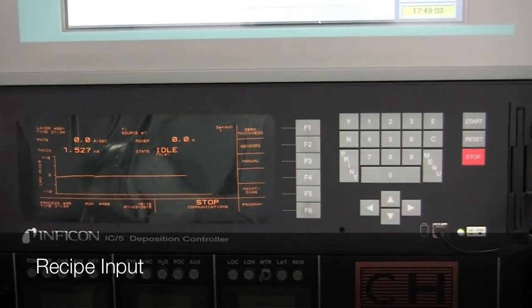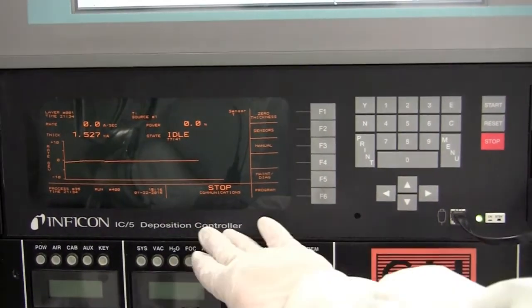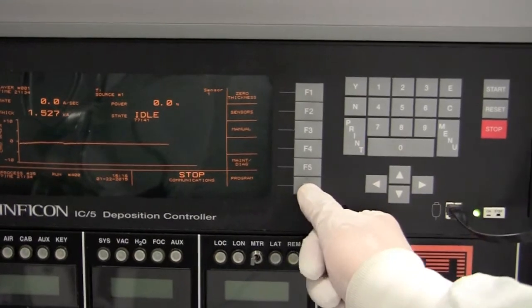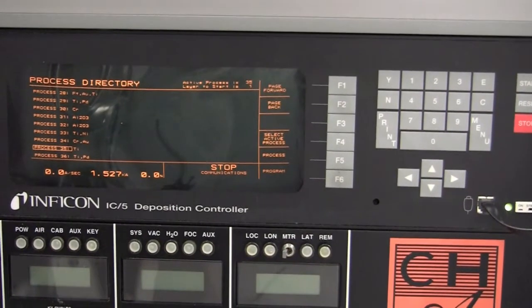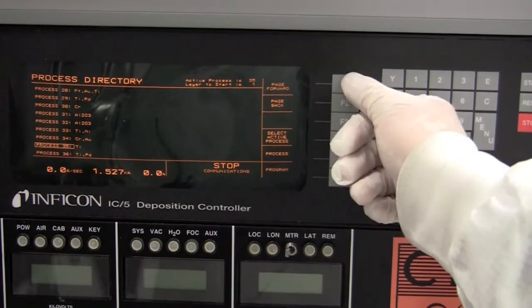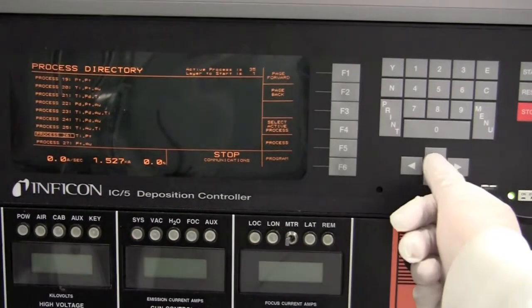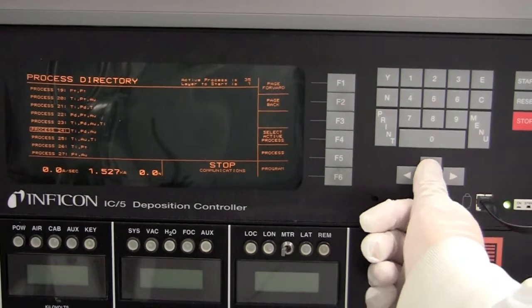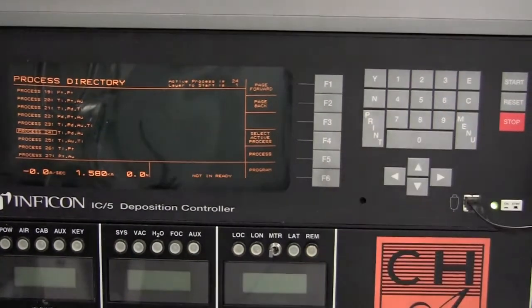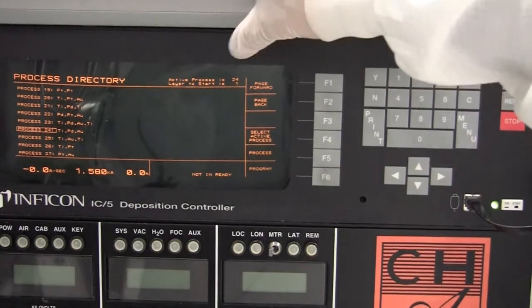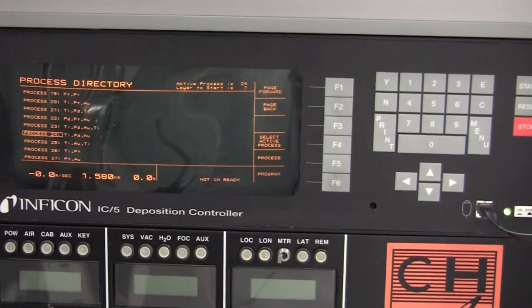While the chamber is pumping down to low pressures, we can go ahead and input our recipe. To do so, we're going to go to the recipe panel, push F6 for program, go to the process directory, and now we have a directory of all the processes for deposition. Using page forward and page back, I can find my necessary recipe. Today I'm going to run recipe 24. So I'll go up to 24 and then select, push F4 for select active process. Once I press that, we can now verify that the active process is 24, which means that we successfully loaded our recipe into the computer.